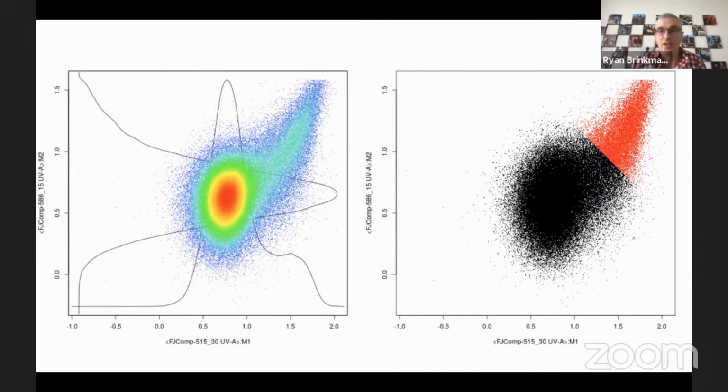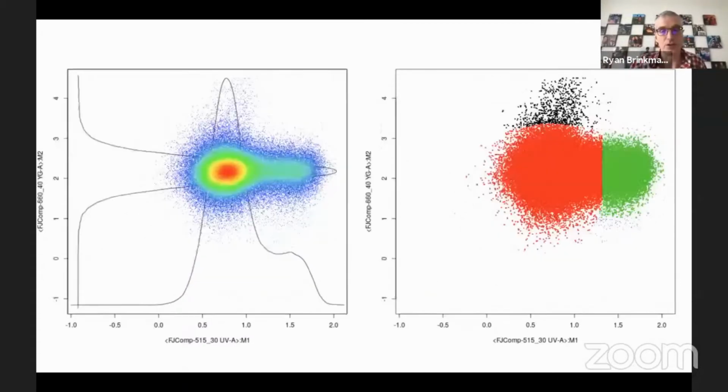Now, in some cases, you might want to join tails to the main population. Sometimes you may not, but unless you can break these components apart, you never have the chance to put that back together. So we've taken the approach that tails and things we want split off, and then in specific biological context, we can put them back together. But there's only a few component pieces, and people seem to be doing a really good job.